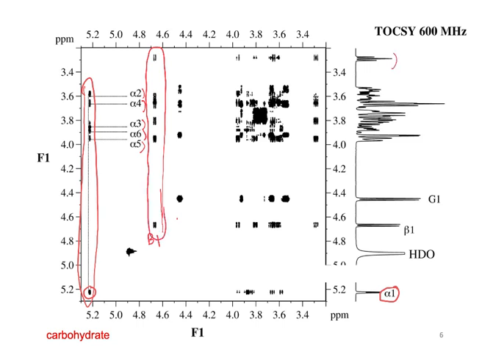So we can see, for example, this triplet that's the most upfield out of these, this is part of the beta spin system. And then here's the glucose or the galactose one, and we see all of the spins in that system. So we could take cuts out of this as well. We could draw a spectrum that is just along here. It would be like the projection, though, but we'd see where all those signals are in that whole mixture.